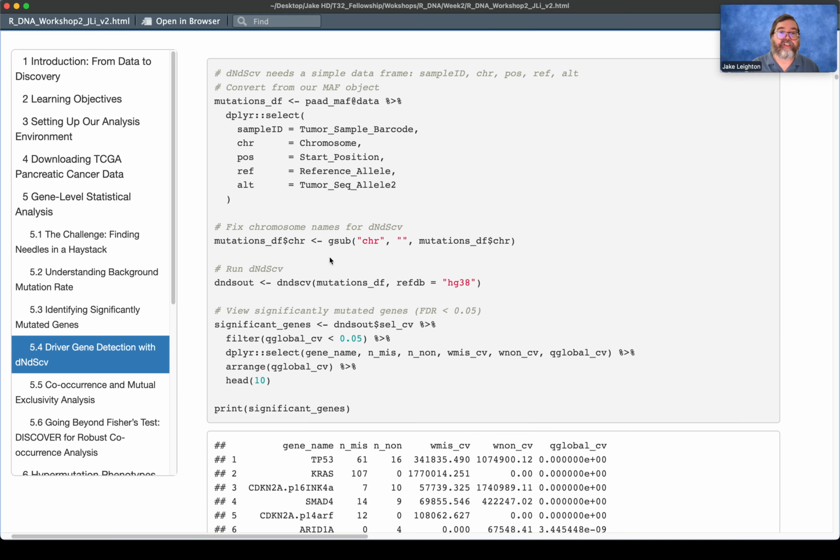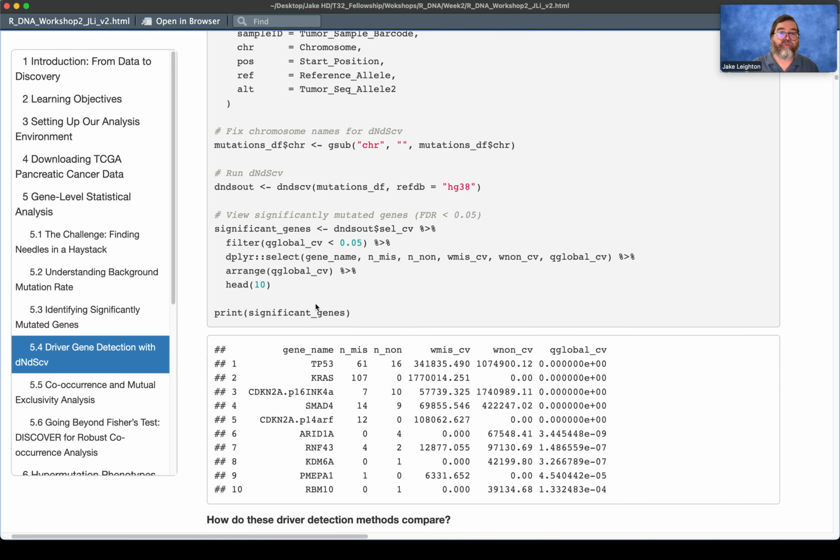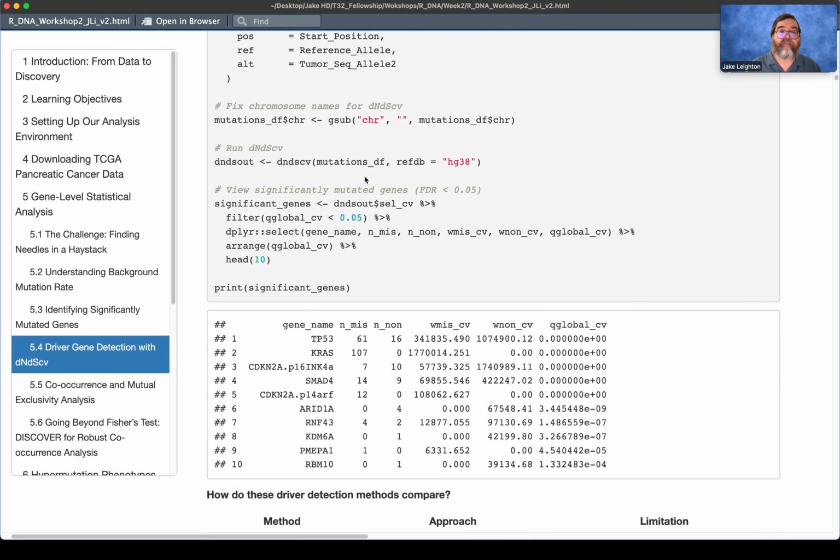So what we're doing is basically we're taking out the chromosome, we're leaving the number, right? And then once we have that, we have our file to put in, and we have our sample, our scaffold of 38. And then we just run our simple function here, get our readout, and then basically if you look at this cell CV column, that's where you get your result.